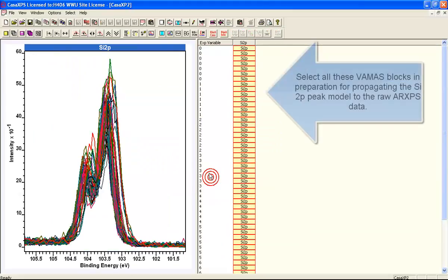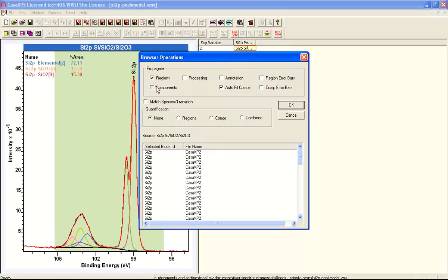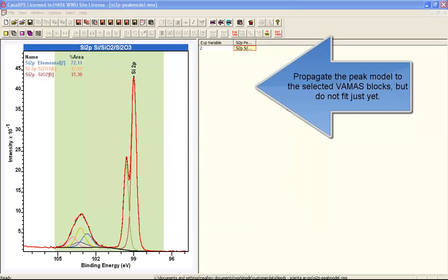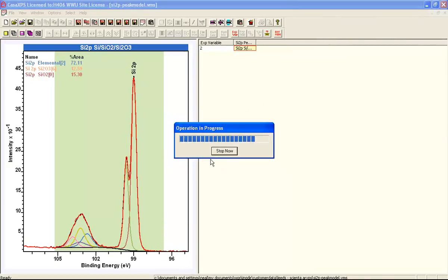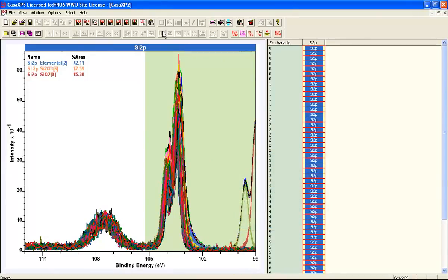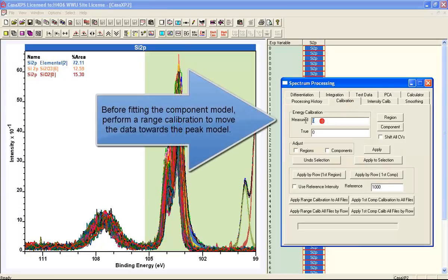While we believe there are two different forms of oxide within these data, the highly correlated nature of the oxide peak makes it quite difficult to create a peak model with a high degree of confidence that you've really separated the silicon dioxide from the Si2O3 signal. So what we're going to do is perform some data treatments that will ultimately lead to a means of constructing a peak model where we can identify these two oxide states from the data itself.